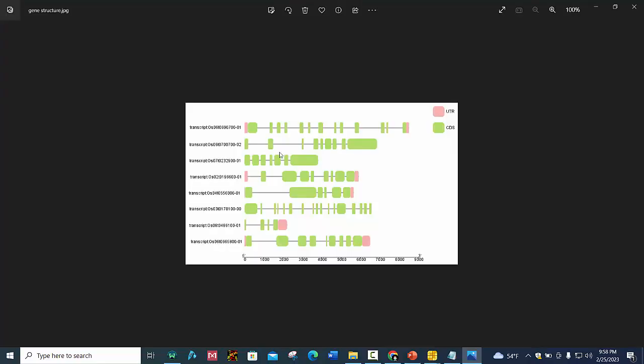By this you can draw your gene structure and use it in your manuscript. It's all about gene structure. Thank you.